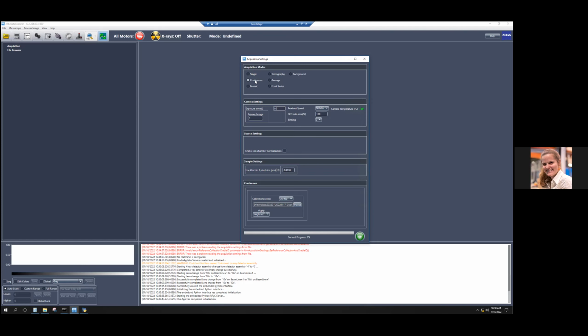You can always do continuous focus, find some spots. I mean, just find the focus and then go to a fresh spot that's at least like 100, 200 microns away, and reduce the damage to that spot. Gotcha. You shouldn't have a real change in focus if it's just that small distance, but you should be far enough away that the radiation doesn't matter.